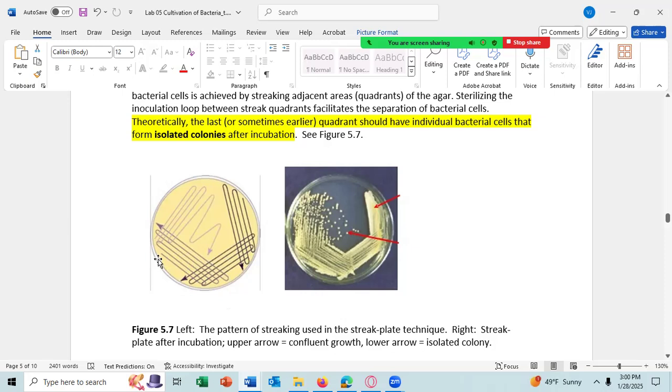Start in quadrant 3 and then go into quadrant 2. But once again, don't go into the high density region of quadrant 2. Go into the lower density region of quadrant 2 about 3 or 4 times. So come in this region, come here, and then streak it out in quadrant 3. Quadrant 4, they've actually done correctly. They streaked it out in quadrant 4, went into quadrant 3 where it's on low density in quadrant 3. Go about 3 or 4 times. They did a little more than they should. And then streak it out 20 to 30 times in quadrant 4.